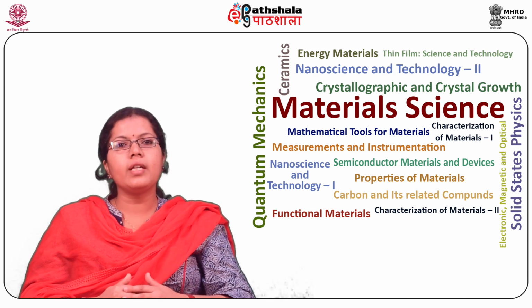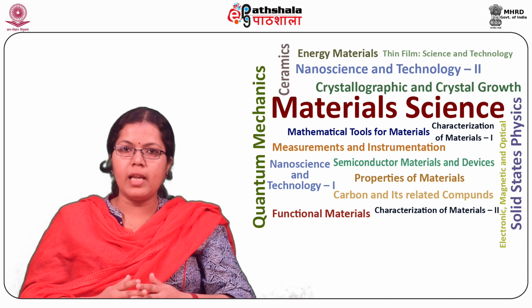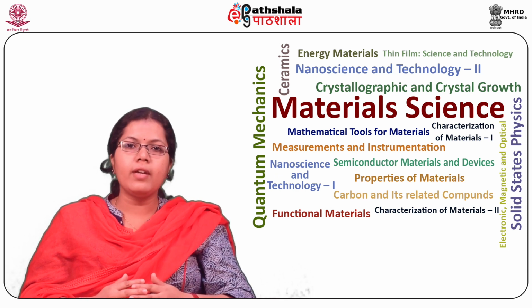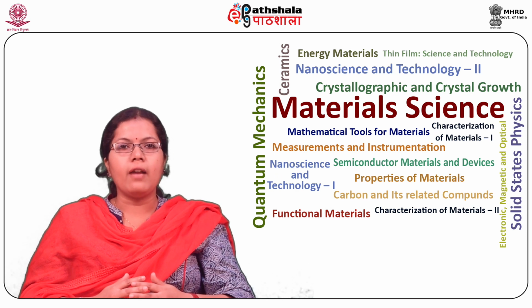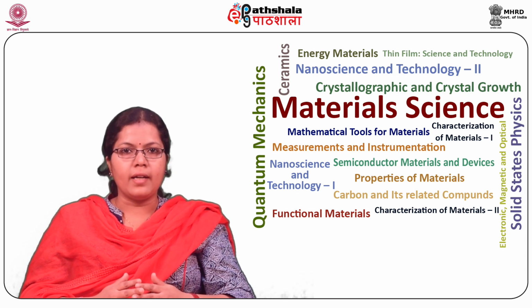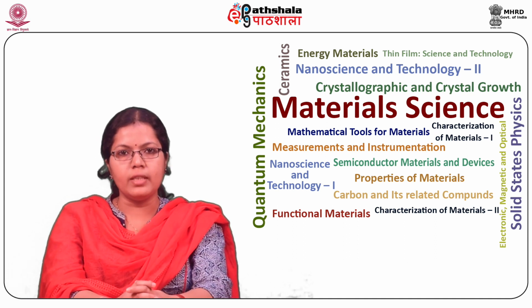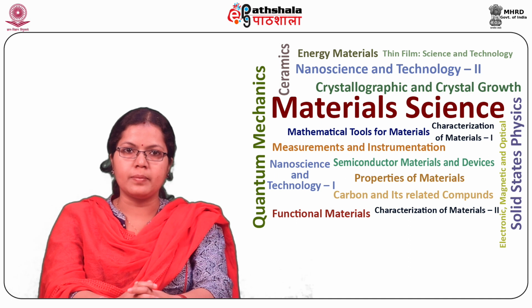Specimens can be observed in high vacuum in conventional SEM, or in low vacuum or wet conditions in variable pressure or environmental SEM, and at a wide range of cryogenic or elevated temperatures with specialized instruments.